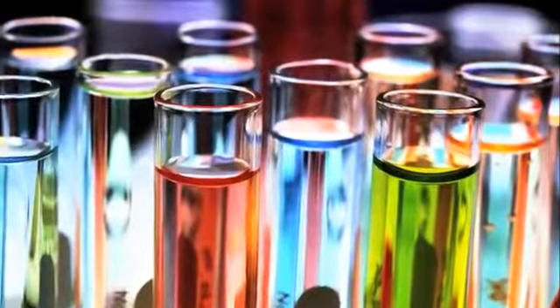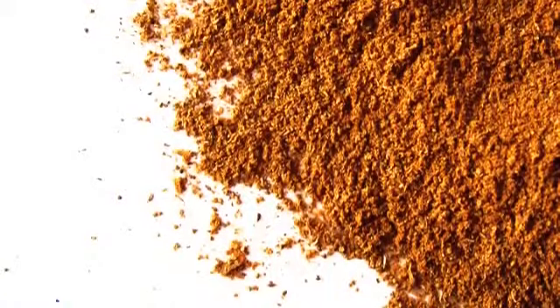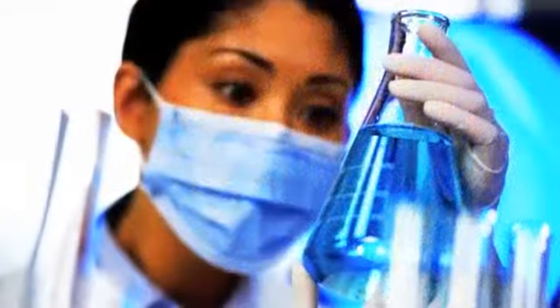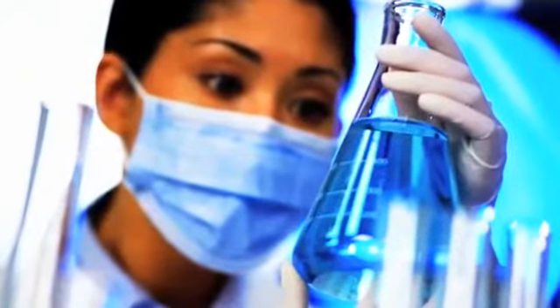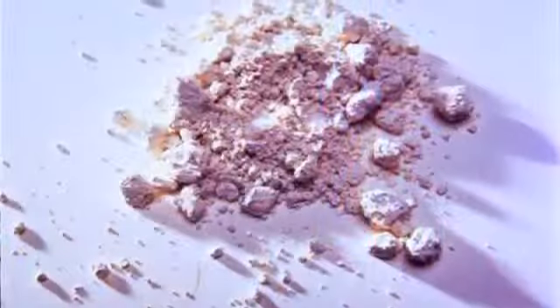The introduction of HunterLab instrumentation into chemical applications has revolutionized the entire industry. HunterLab systems enable those in the chemical industry to measure reflected and transmitted color of chemical and petroleum products in all different types of forms.